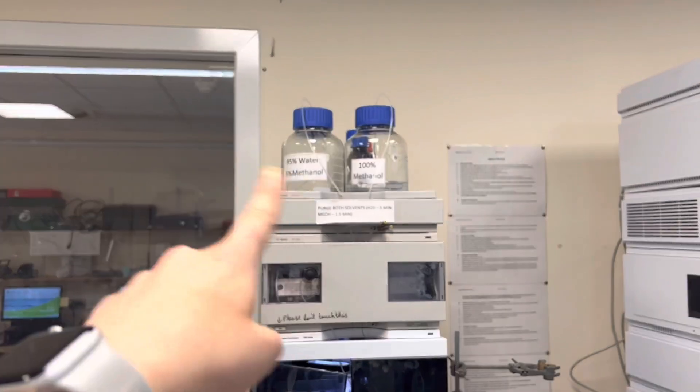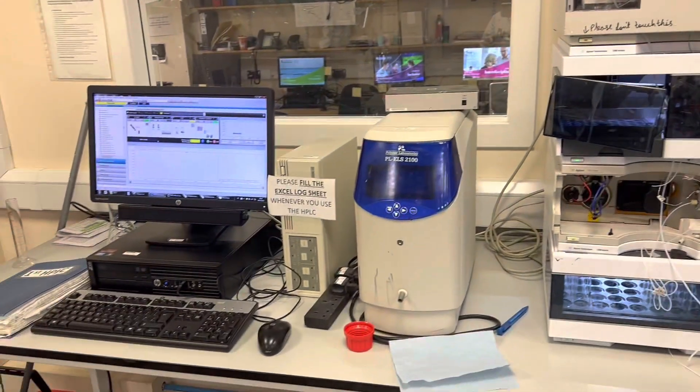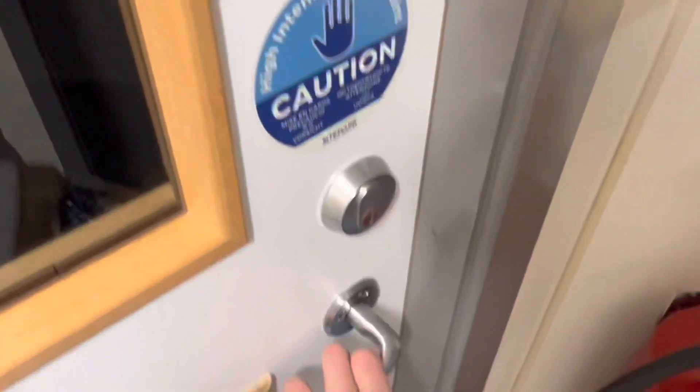I'm going to fill up the mobile phase bottles and then start purifying my sample. First of all, I actually need to check if my sample is dried in the freeze dryer.